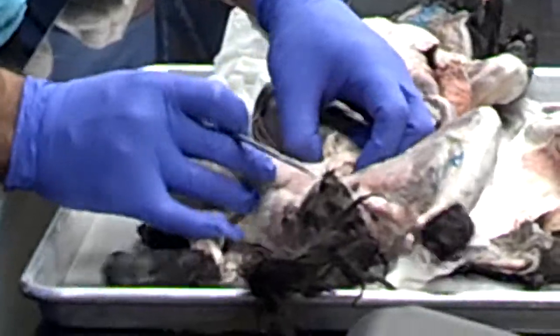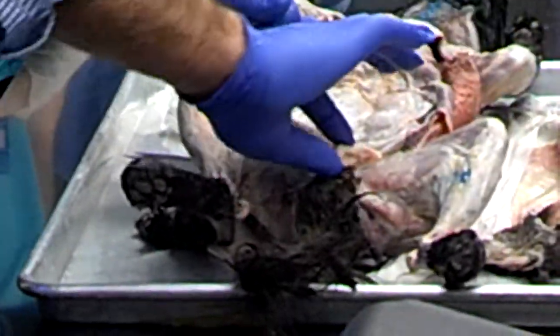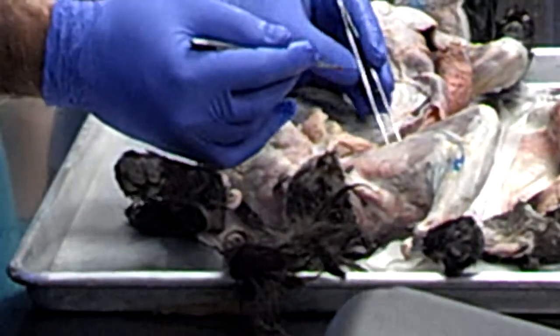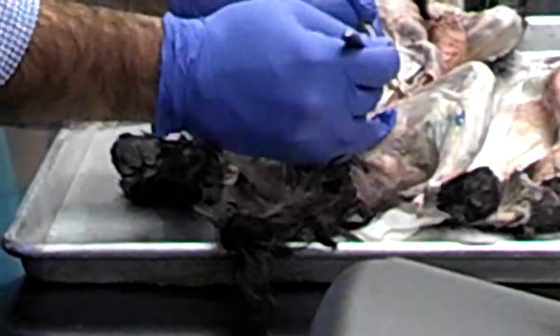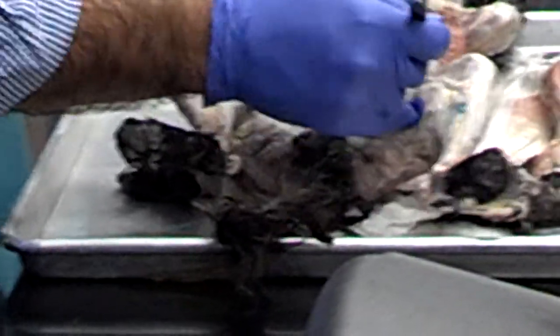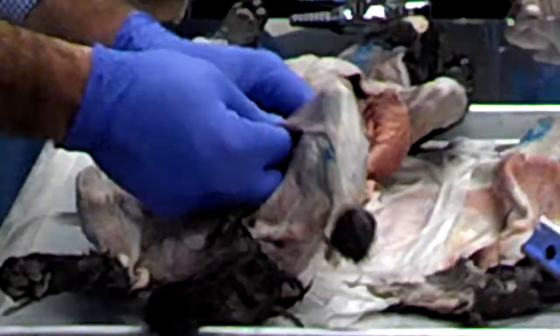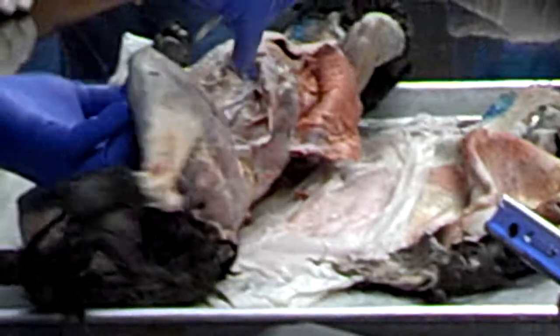Okay? So this is this part, then we come down here. Here we have these two muscles that we are looking for, sartorius and gracilis. On the outer side is your sartorius, on the medial side this is your gracilis. So I'm going to lift this up. You could see the lining there, right? So I'm going to lift it. I'll lift it up and I'll use the back side of the blade and we'll separate it right there. Got it? And you have to do it from this side too. You see this one? Right here. So I'm going to use right here, go and separate it from the underlying muscles right there.